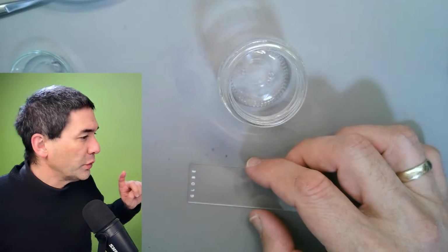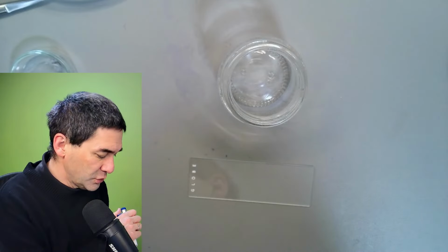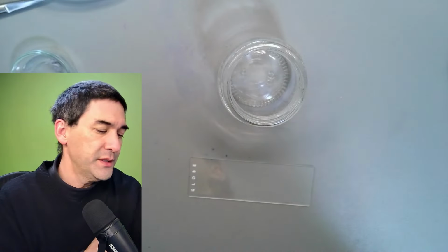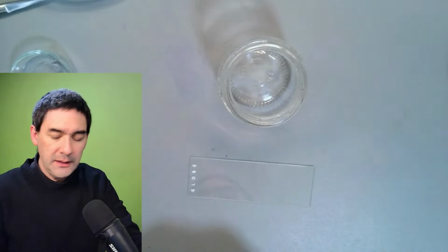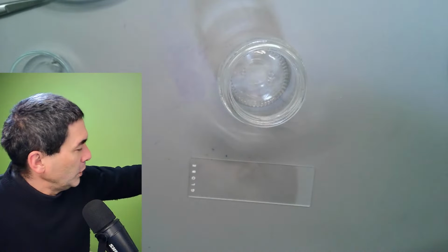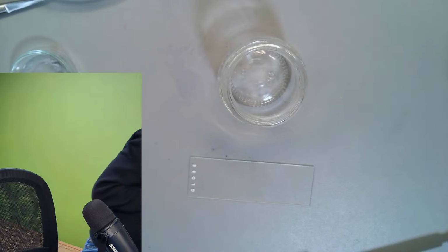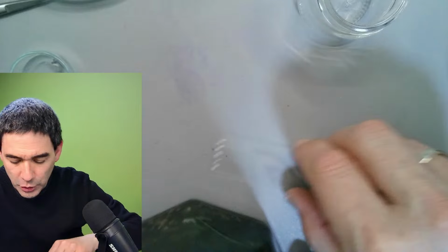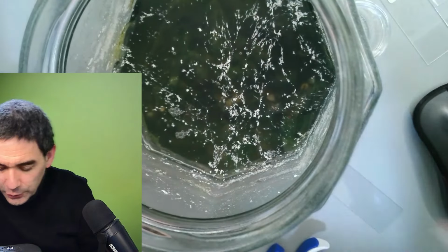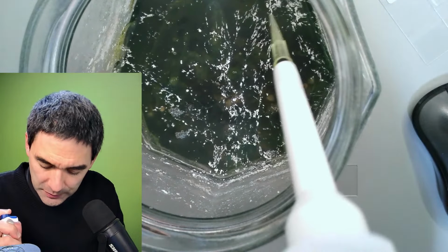I'm going to show you something very briefly, and then I'm going to show you how to make a so-called enrichment culture, because that's also something that I'd like to try again. So I'm going to grab again my old little water sample. Here we go. This disgusting looking jar with this weird stuff floating on top. Some of you might actually remember from last week. So let's put this under the microscope again.